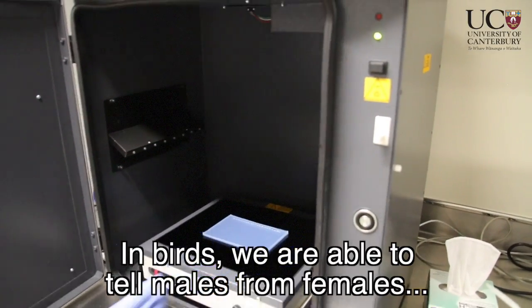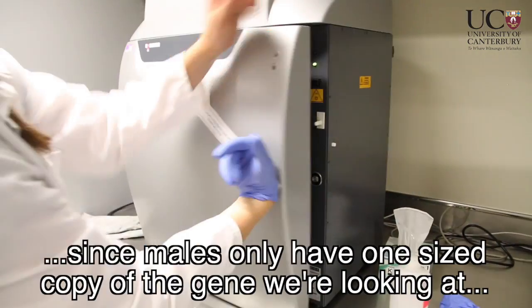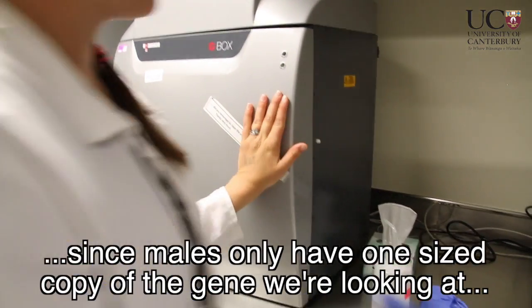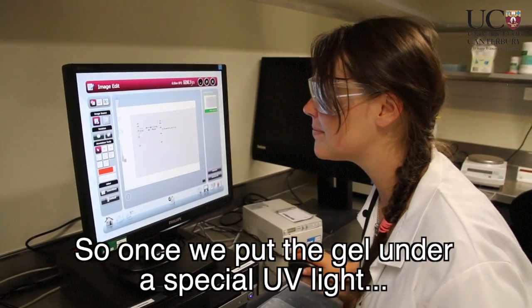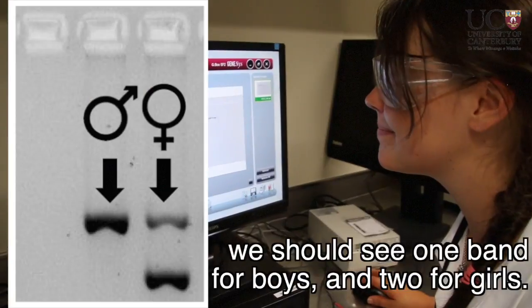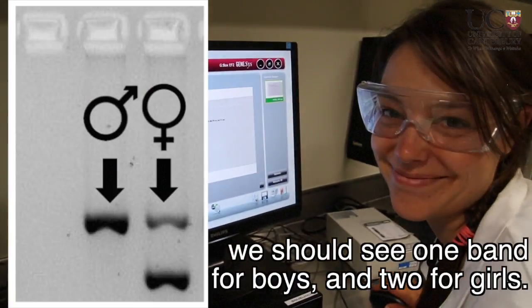In birds, we are able to tell males from females, since males only have one sized copy of the gene we're looking at, and females have two different sizes. So once we put the gel under a special UV light, we should see one band for boys and two for girls.